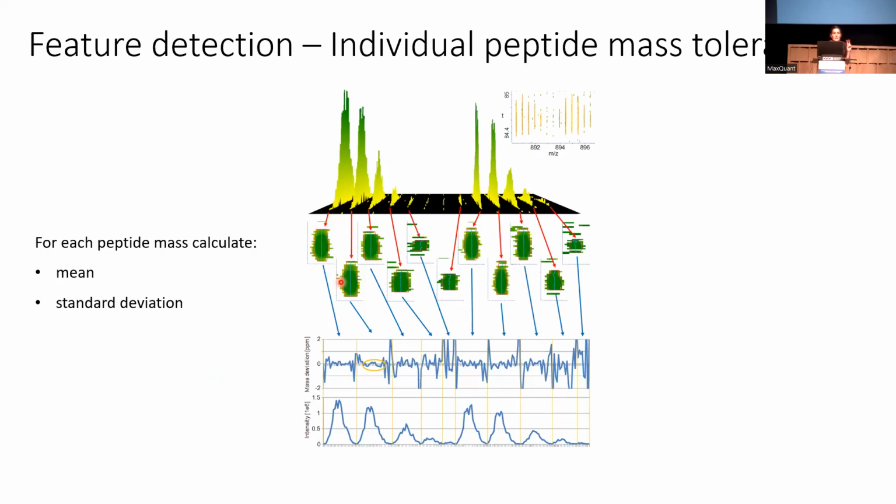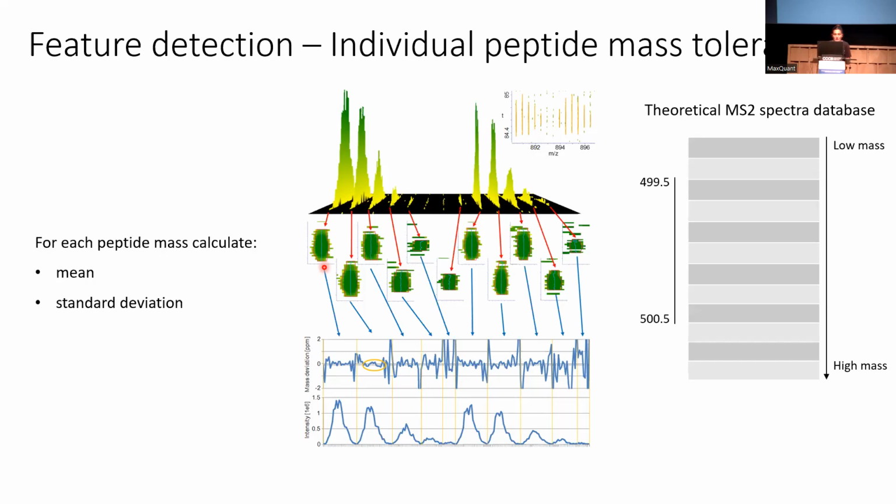So two things that we can get from this: you remember that the line from the centroid was not actually a straight line, but it should be in the ideal world. An easy thing that I can do, since I have so many measurements, is just take the mean of it. So for all of these different measurements, I will take the mean, which will help me later, we will see. And also I will take the standard deviation of the error of this wiggly line of the centroid. Let's see how this will help us and where.